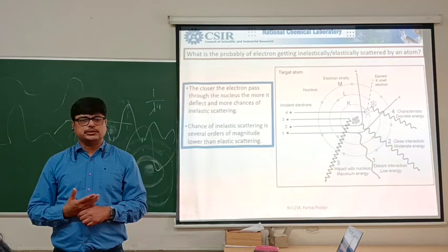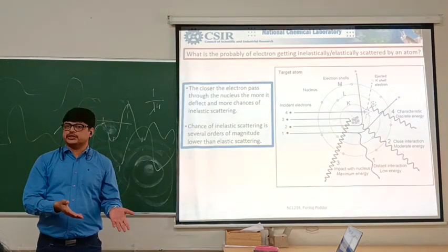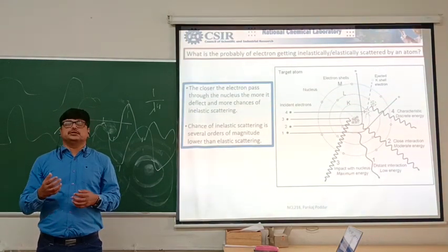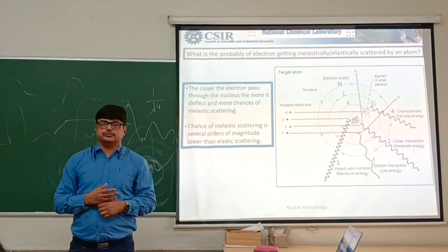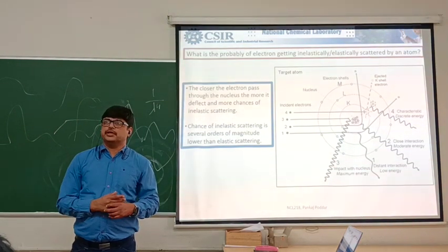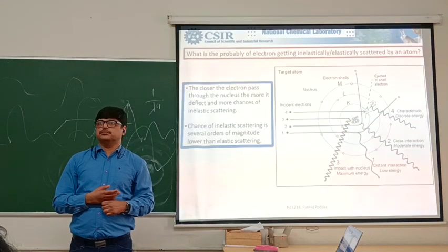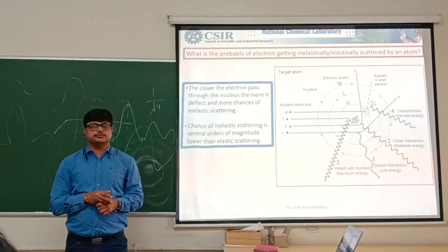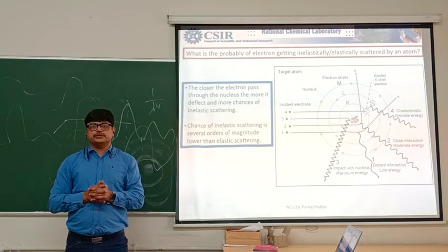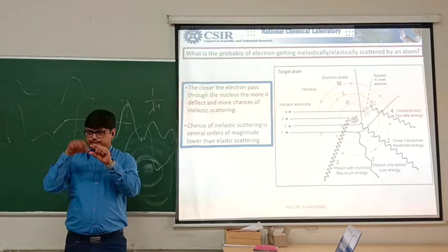So it exactly happens in electron microscopy. You are right that you are doing two things. You are bombarding electrons, so the sample will charge up, which is not good. And you are also ejecting electrons out, but you are pumping electrons in as well. So the net charge is usually negative. That's the problem, and it's a bigger problem in SEM. In TEM, it's not a big problem, because the answer to this great question is that the TEM sample holder is a TEM grid, which is a 3 millimeter copper grid. It's like this.